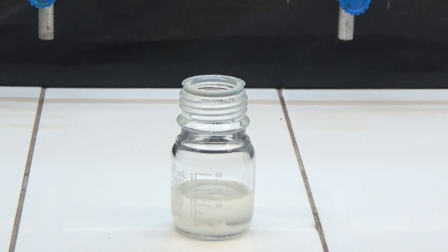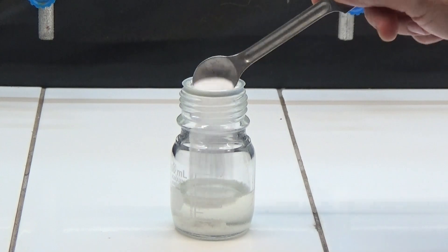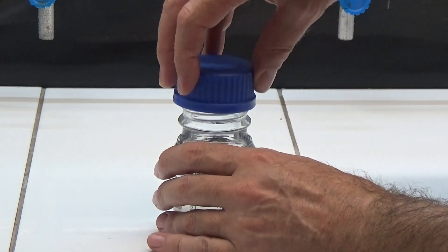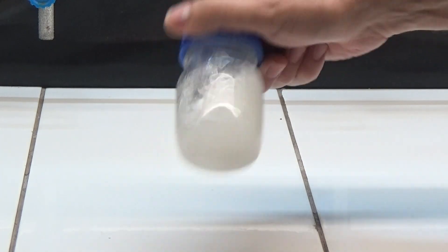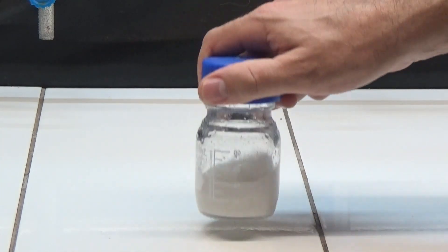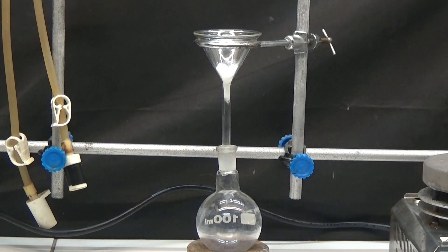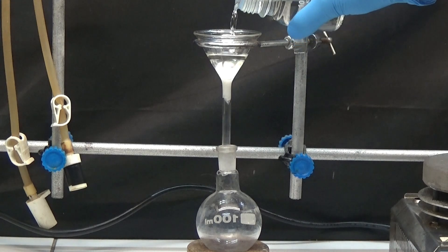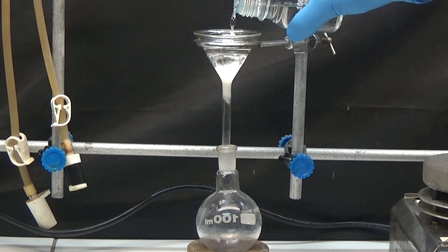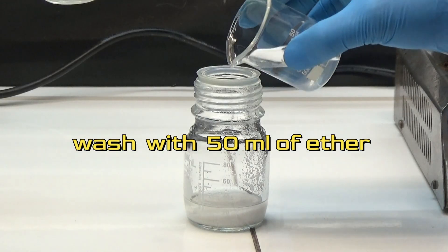Anhydrous magnesium sulfate is used to dry the organic phase and it is allowed to stand for a few hours. Filter to separate magnesium sulfate and wash the desiccant with about 50ml of ether to extract as much ester as possible. The 50ml of ether is attached to the dried ester.